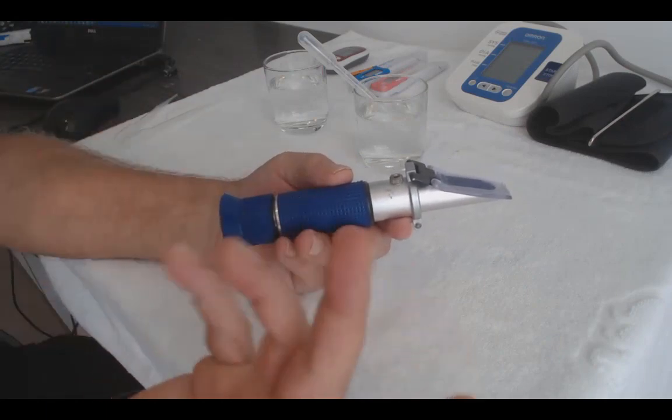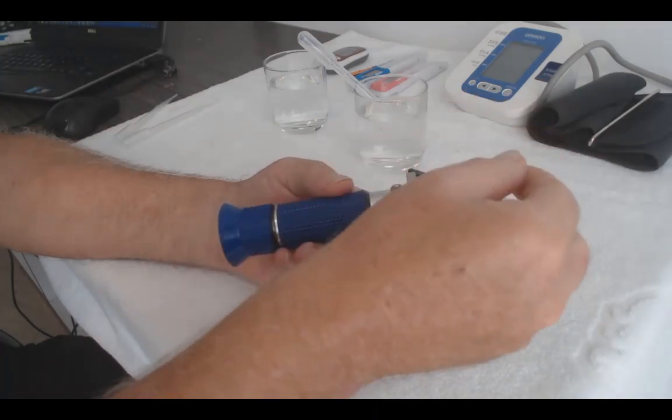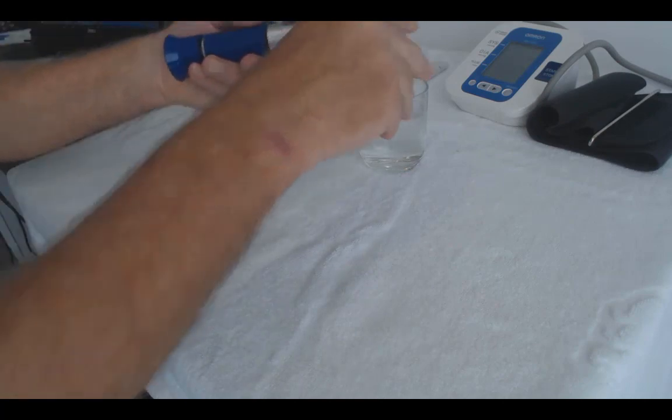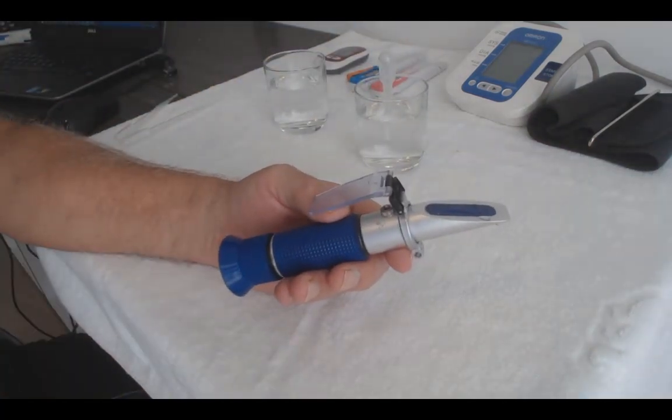Okay, now as far as taking the sample, it's as simple as what I did just now. Let's just say we wash that off. What we would do, we would wash that off there. I'm not using urine here. I'm in the hotel room at the moment. I don't have the facilities to use it, so I don't use it.